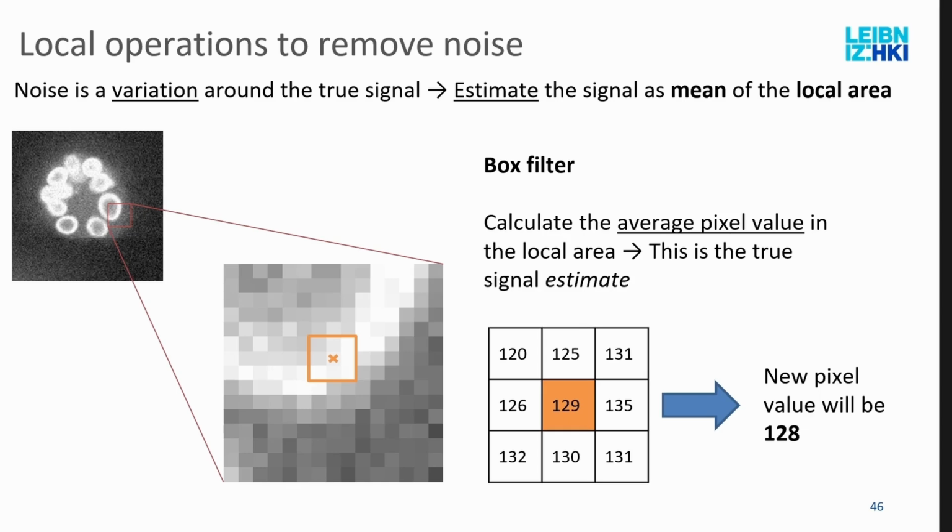The mathematically correct thing would be to stop here. With this 3x3 filter, you cannot go here because you would go outside. But then the more you apply it, the more your image shrinks further. So this is no fun because at some point your image is gone and you lose information, and the size changes. So the tools do different things.